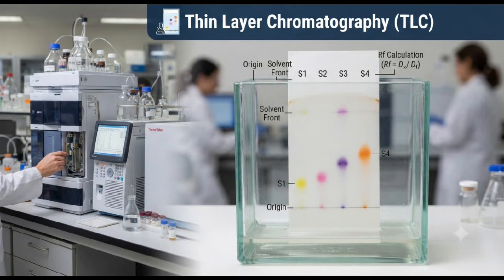Hello everyone. Thin layer chromatography, commonly known as TLC, is a simple, rapid, and widely used chromatographic technique for separating and identifying components present in a mixture. It is commonly used in pharmaceutical analysis, research laboratories, chemical analysis, and reaction monitoring.